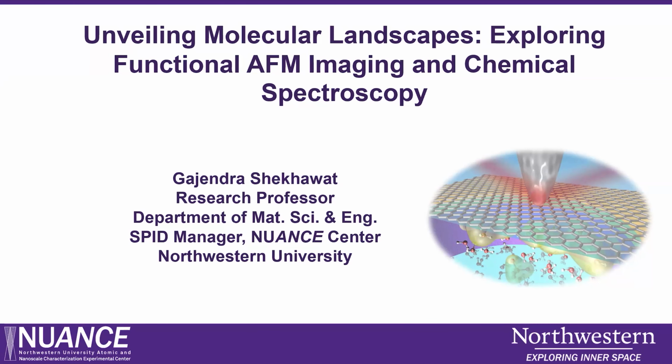I'll be talking about some of the functional aspects of the AFM imaging that includes Raman spectroscopy and nano IR, because I have seen that over the years.